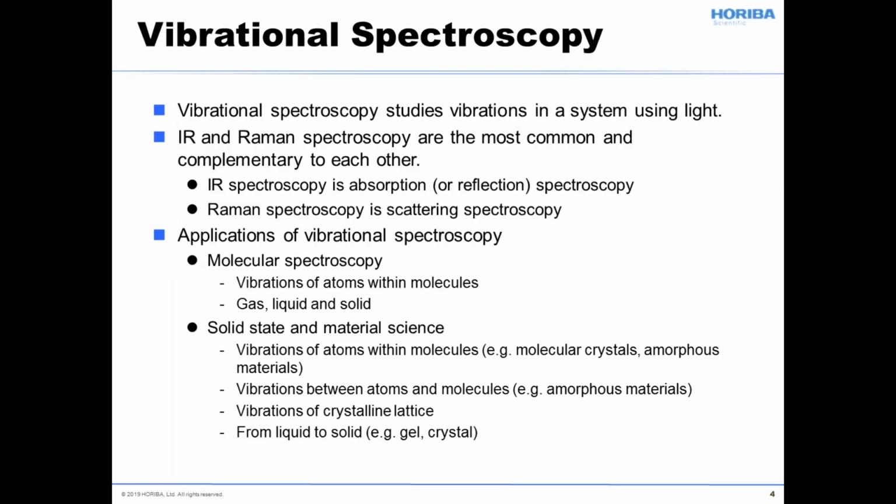specific identification. So Raman spectroscopy is a vibrational spectroscopy. Most people are familiar with infrared absorption as a vibrational spectroscopy, but Raman spectroscopy is also a vibrational spectroscopy. And both of them, of course, are based upon the study of materials through the interaction of light with molecules or compounds such as covalent solids, ionic solids, that sort of thing.